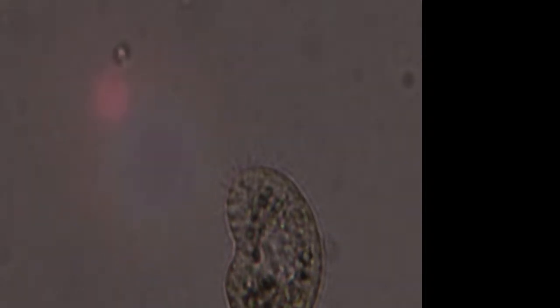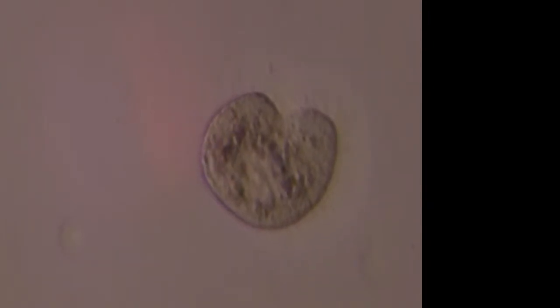Change up the lighting here. See a little bit better. This is oblique lighting, so you get more of the 3D structure of the object. As it tumbles, you really get the 3D effect. Get back here. You can see the contractile vacuole at the back spitting out water for water balance. Now it's starting to move too much, of course.